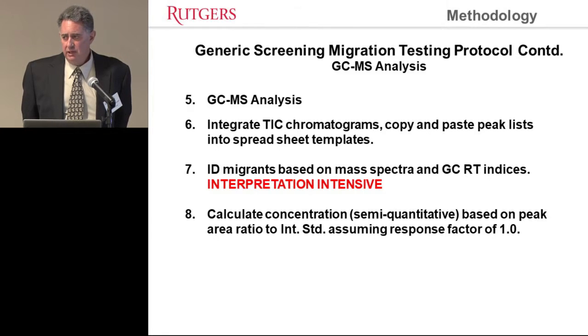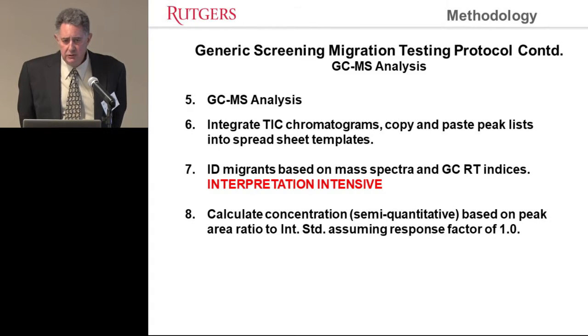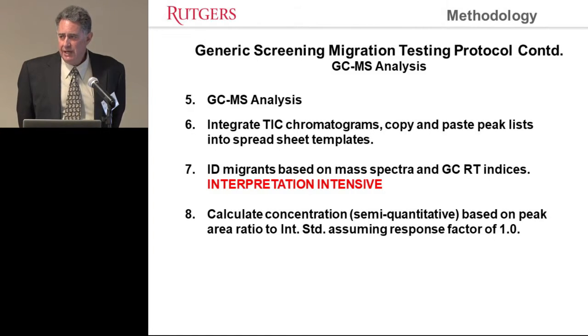The data integrity that you produce from mass spec is only as good as the libraries that you're using to identify the spectra. Libraries are limited, especially in the packaging migration arena, so you need to build your own libraries, and you have to have a big database to refer to do a really good job in this. And you often need to do interpretation and detective work to do a good job identifying the migratory species. I've been at this 40 years, and we have tens of thousands of spectra in my lab, not just in packaging, but in flavors and fragrances and all different areas that we identified and created databases.